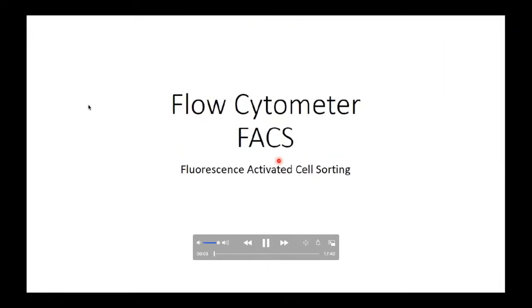Hello guys, this is a continuation of the subject flow cytometer and FACS mechanism. In the previous video, I spoke in details about flow cytometer. And in this video, I'm going to speak about FACS mechanism, fluorescence activated cell sorting. If you didn't watch the previous video, I highly recommend you to go and watch it, because it will be much easier to understand FACS mechanism if you fully understand the flow cytometer mechanism.